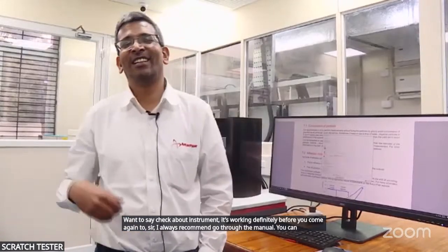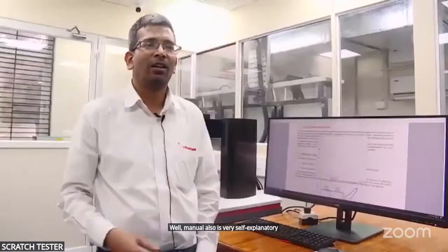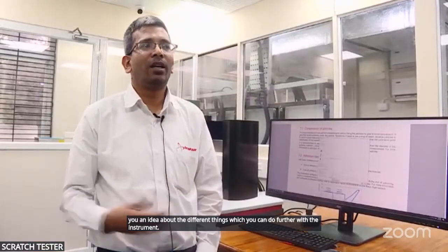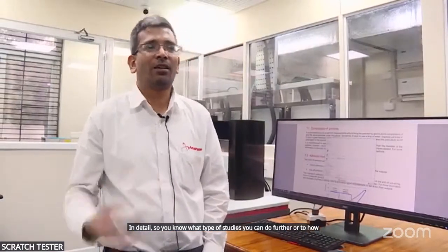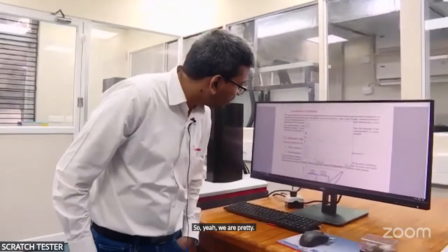You should ask him for the manual first, go through it, get an idea, because that also will give you an idea how to do the measurement, what you take out, because the manual is very self-explanatory, very detailed, and it also gives you an idea about the different things you can do further with the instrument. So you know what type of studies you can do, or how to extract the most out of your instrument, so that you can have more accurate values and study. So yeah, we are pretty good now.